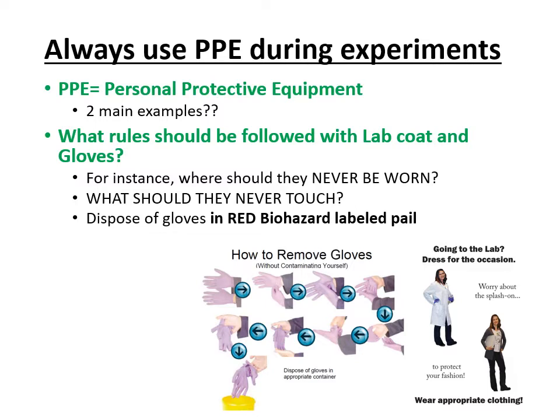That means you never step into the hallway, into any other room while wearing a lab coat or gloves, okay? They are to remain in the laboratory, and ideally, you would even store them in the lab that you're working. Okay, so for instance, at our school, we give you lockers to store them, and we then overnight put them in the laboratory in sealed containers. Okay, you want to make sure that they are kept safe and away from your other belongings and whatnot.